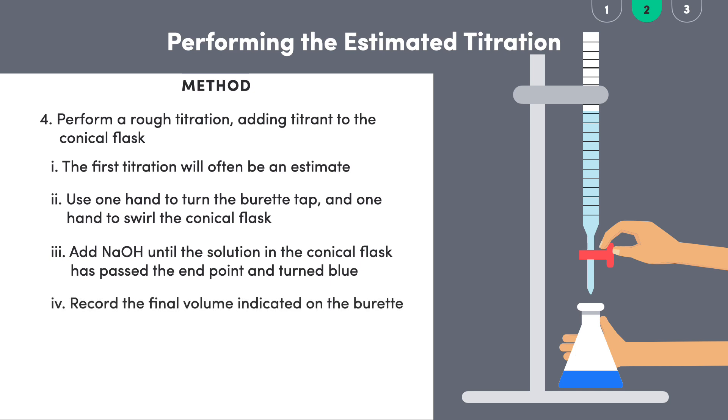We now record the final volume of sodium hydroxide indicated on the burette. We'll say this is 19.72 milliliters. We subtract the initial volume, which was 2.35 milliliters, from this final volume to get a value of 17.37 milliliters as the rough volume of titrant needed to reach the endpoint in this titration.